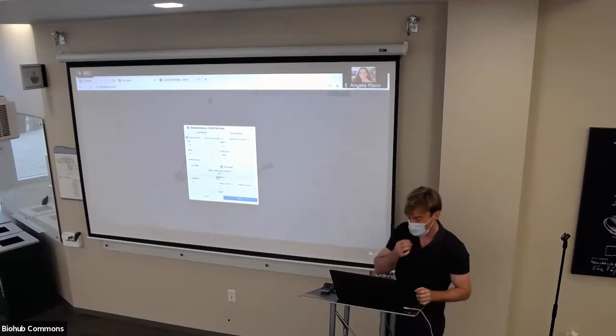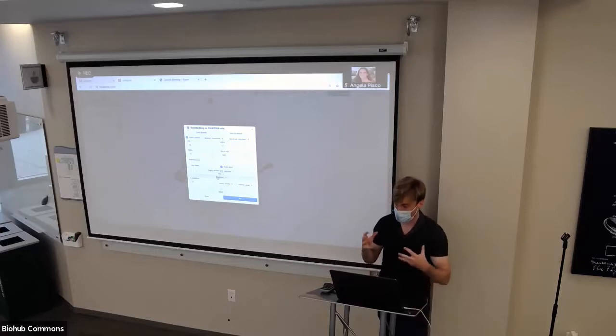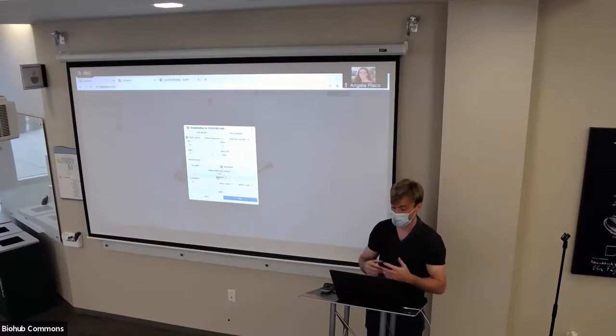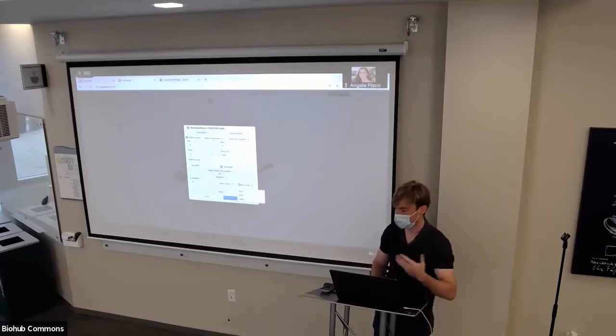And here, a step I didn't really discuss in these analysis workflows, but it's crucial for single cell analysis and dimensionality reduction, is constructing a nearest neighbor graph. This graph is an abstract construct that is just a graph of nodes and edges. Each node is a cell, and there's a connection between two cells if they're similar to each other based on some distance metric. So these parameters mean: how many neighbors do you want each cell to have? How many edges will be connected to each cell? What is your distance metric? Here it's default cosine, but you can use correlation or Euclidean. And then there are various methods for actually constructing this graph, all with their own algorithms.